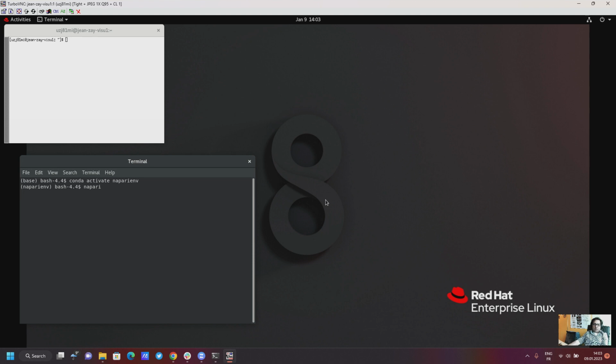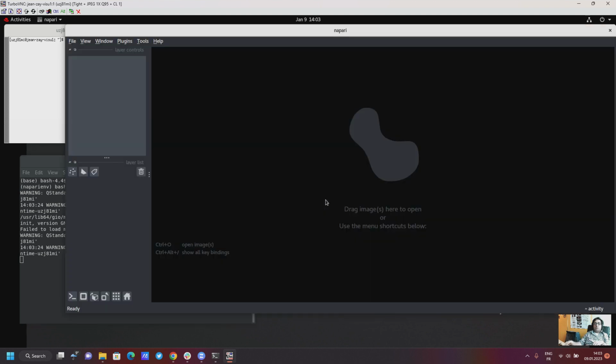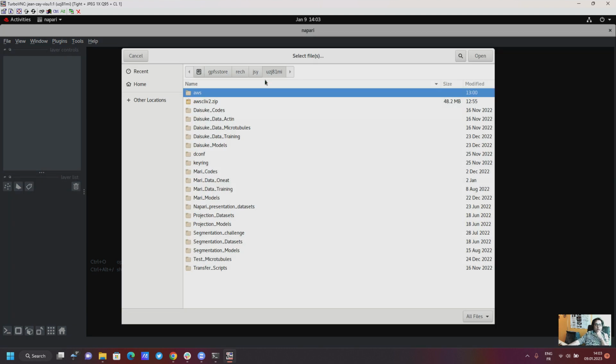So this plugin is VollSeg-Napari-TrackMate. You can get it from Napari Hub to try on your own data. What you need to run this plugin are the TrackMate outputs. TrackMate outputs tracks as an XML file. It also gives you tracks, edges, and spots CSV files. And this plugin uses one XML file and these three CSV files to do all the analysis in Python and in Napari.